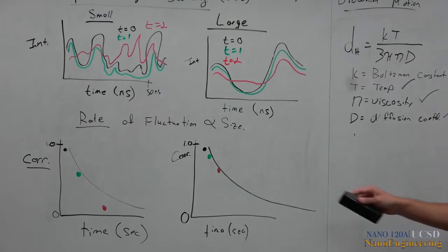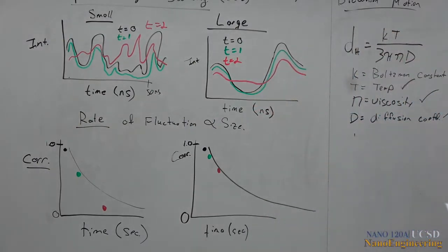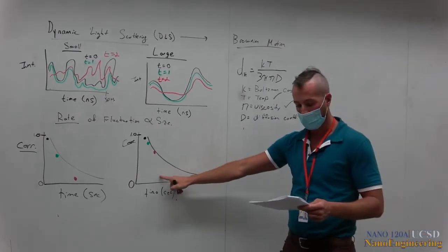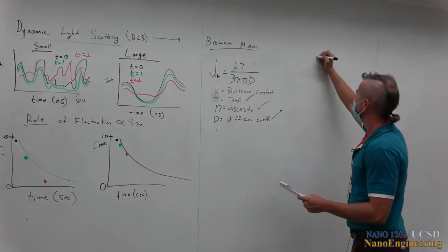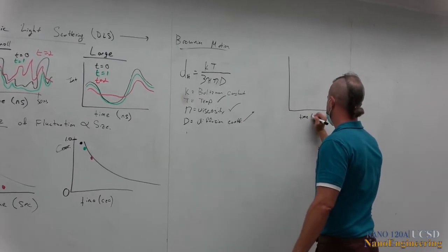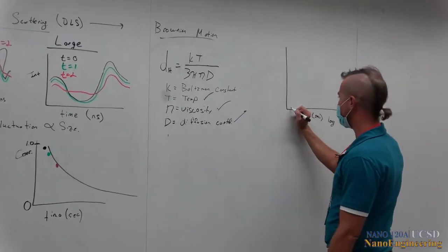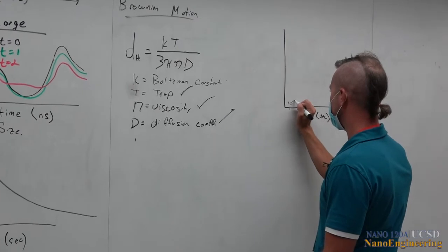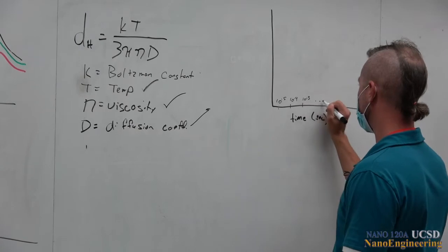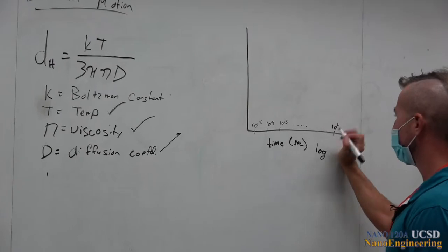This is the raw data. This is actually all raw data. The first piece of data that you're going to see on the instrument takes the log transformation of this. Right, so it's going to be like 10 to the negative 5th seconds, 10 to the negative 4th, 10 to the negative 3, all the way up to, maybe it goes for 100 seconds, something like that.